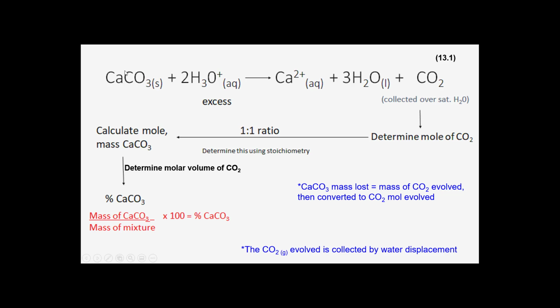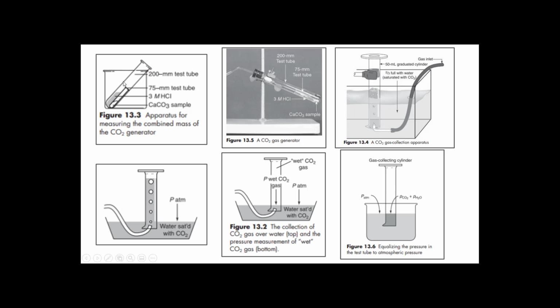So what happens is that you have your sample, and that is what is in here. But the final is the CO2 that's here. This is what we're interested in. Or actually, I should say this one.